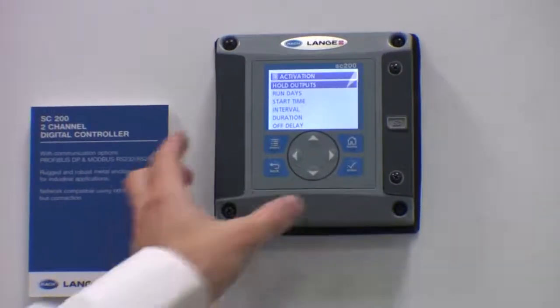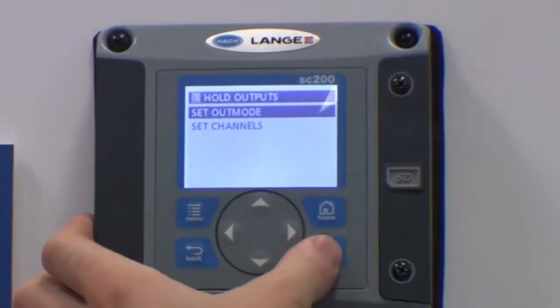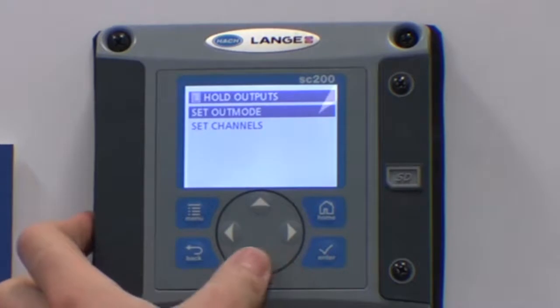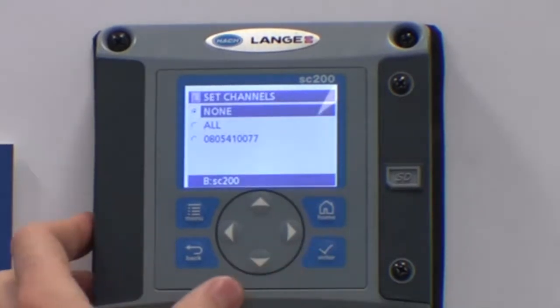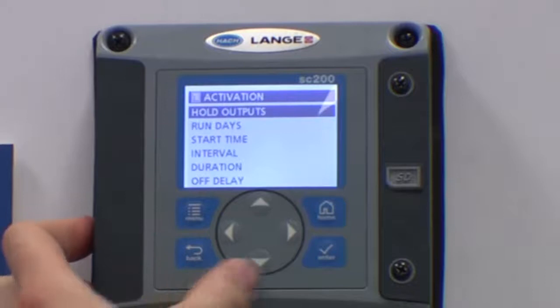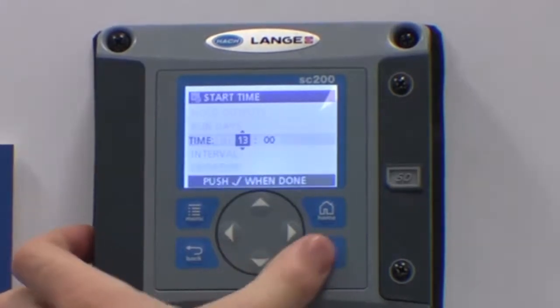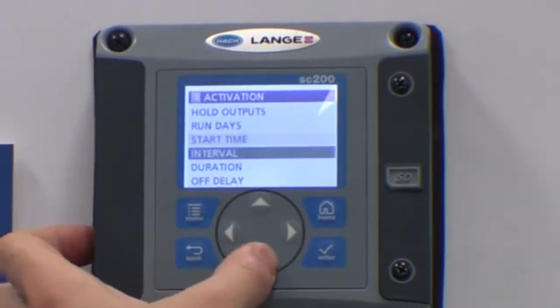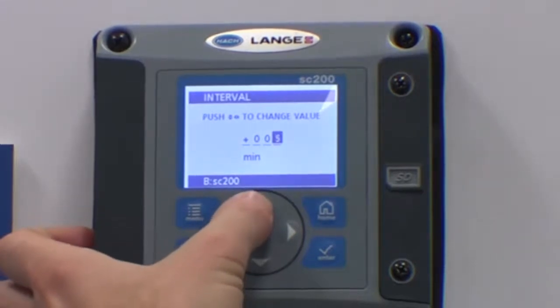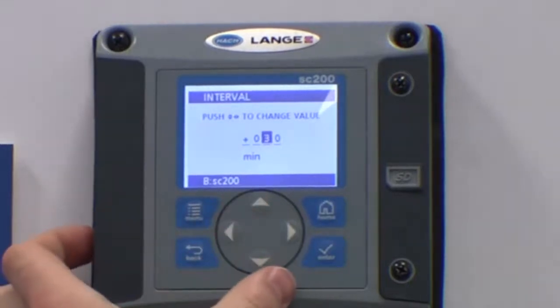Under activation, firstly select how you wish the outputs to behave whilst the air cleaning is active. You can set the output mode as either held outputs or going to a fixed output value. For the channels, you can either hold all outputs or any associated to a particular probe. You can ask the system to run for set days of the week or to start at a set time. The interval is the interval between the air blasts — generally this would be set to every 30 minutes, although it can be set to every 60 minutes for cleaner applications.